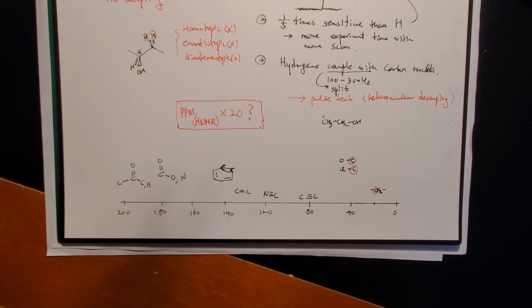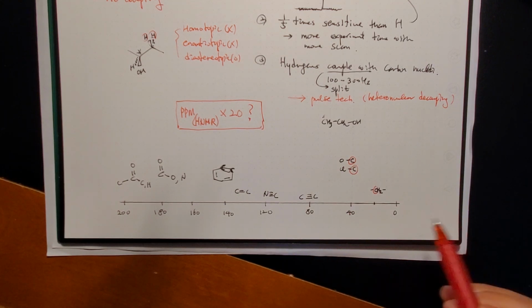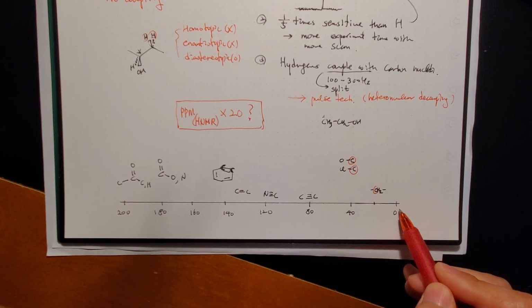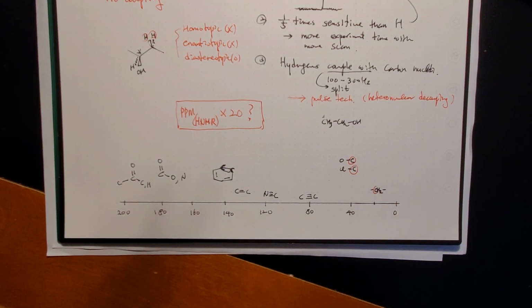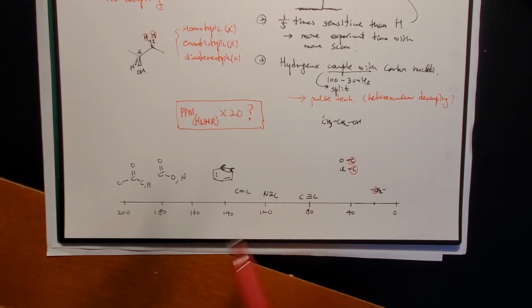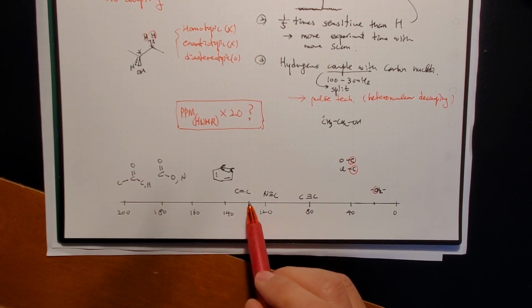We don't totally rely on the exact number of ppm, as you know. So instead of 2 to 1, roughly 20 or less for the normal alkane with no electronegative atom nearby. That carbon shows up here. Then sp carbon-hydrogen was about 3 ppm, but it's now here around 80. Then the triple bonded carbon to the nitrogen with electronegativity comes around 100-something to 120. Then you remember the order.